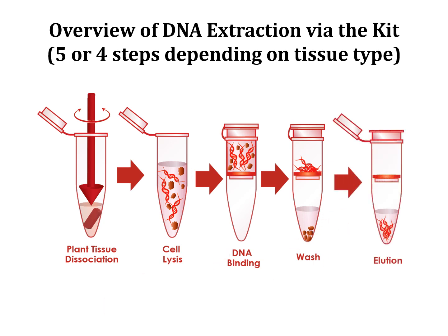The last step is the elution part. In the elution part, you add a buffer so that it releases the DNA, interferes with the charges here, and releases your purified, clean DNA from the column. It disrupts the positive and the negative charges and releases the DNA. This is called elution. Then you can take this DNA and do your analysis with it. You can do PCR or other analysis. So now we have purified DNA.